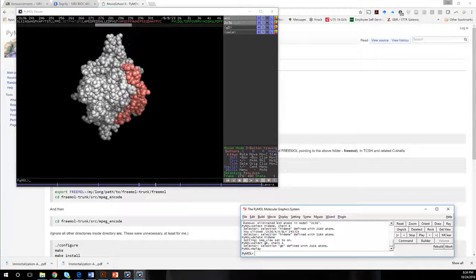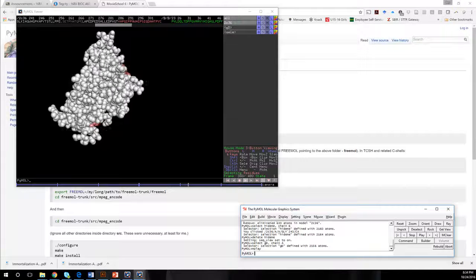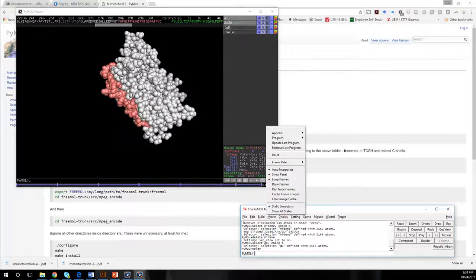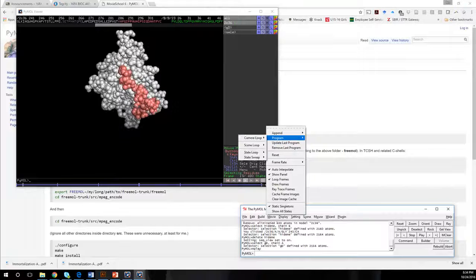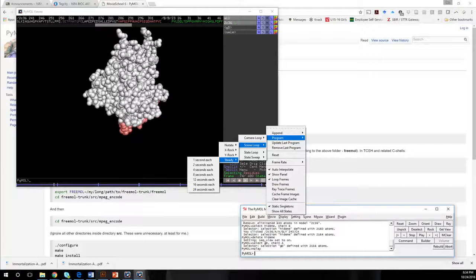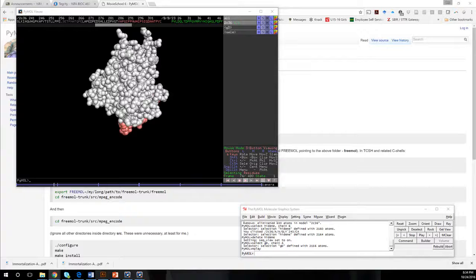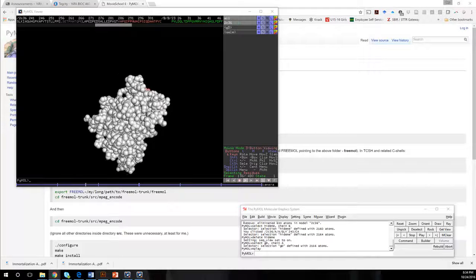So then it's going to do the around the X-axis, then around the Y-axis. You can do the Z-axis; it makes it look like a propeller. But that's a command line. I don't know that they have any Z-axis in there, so I just made a steady state one. Okay, so you can also in the example they give you how to do rocking, and they show you how to nutate and all sorts of other things.